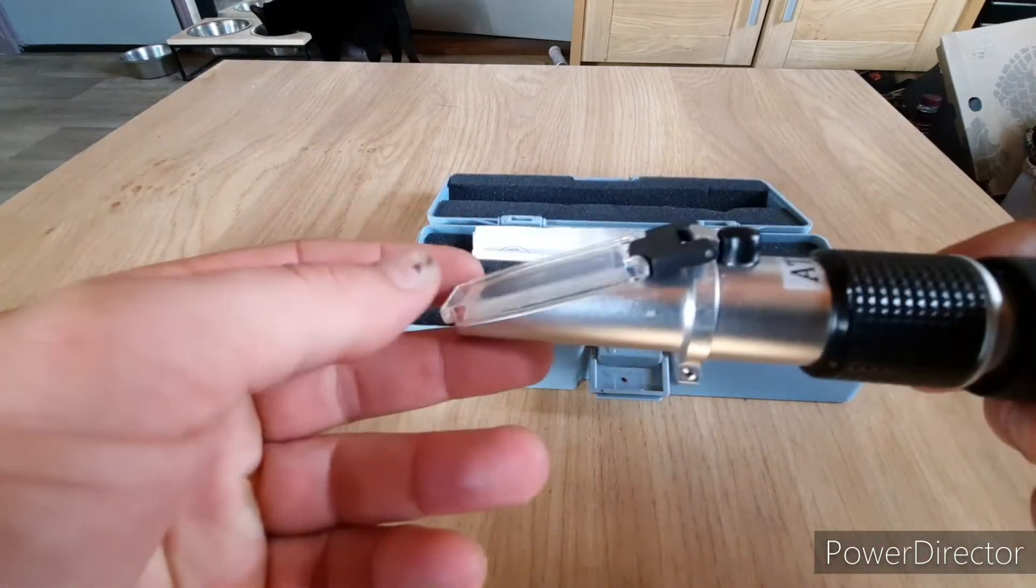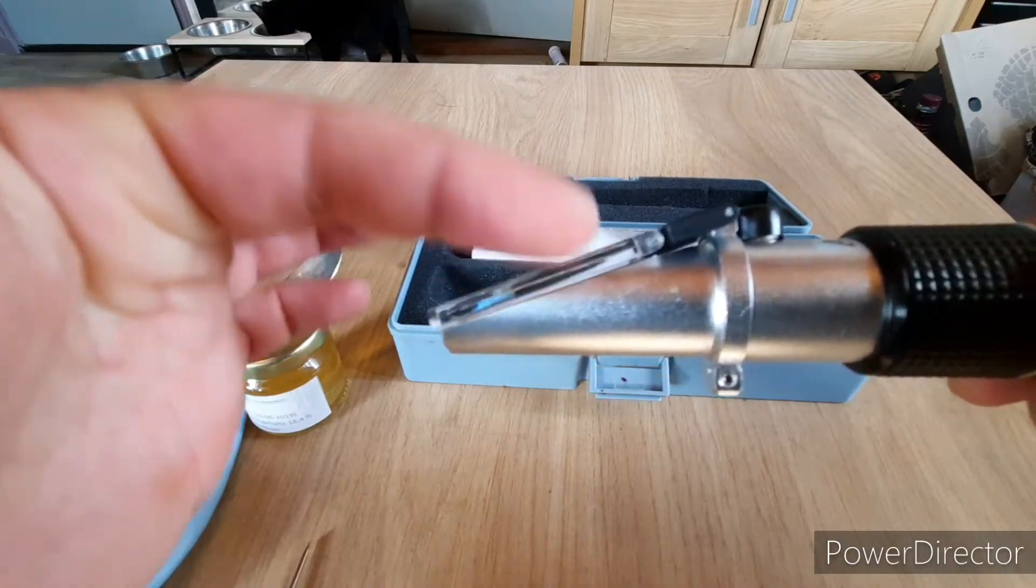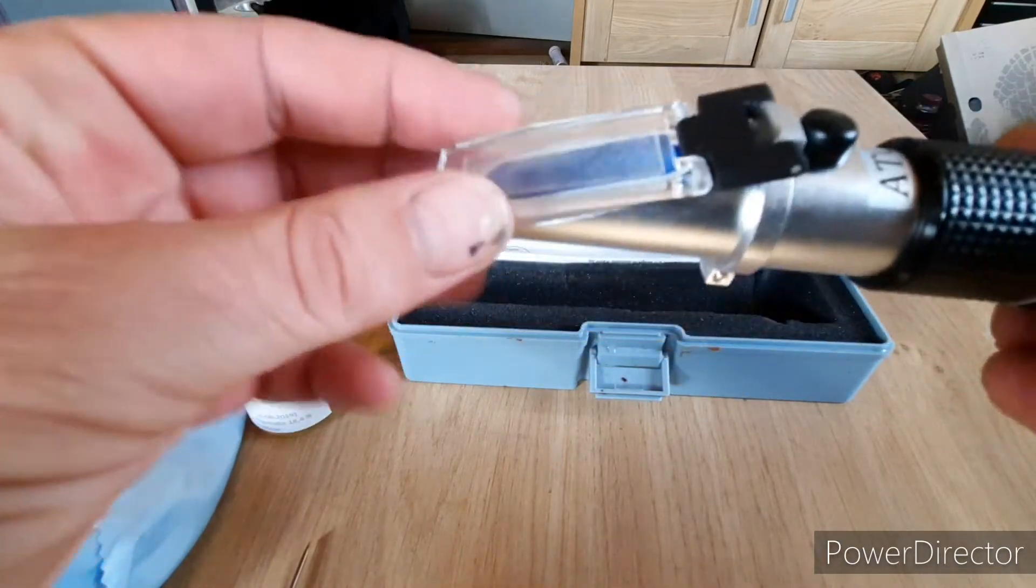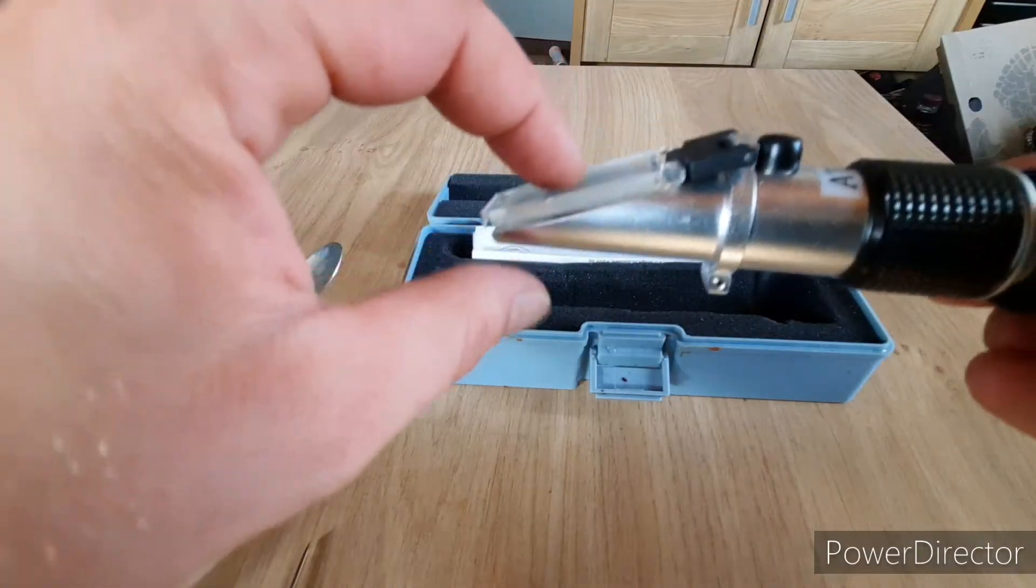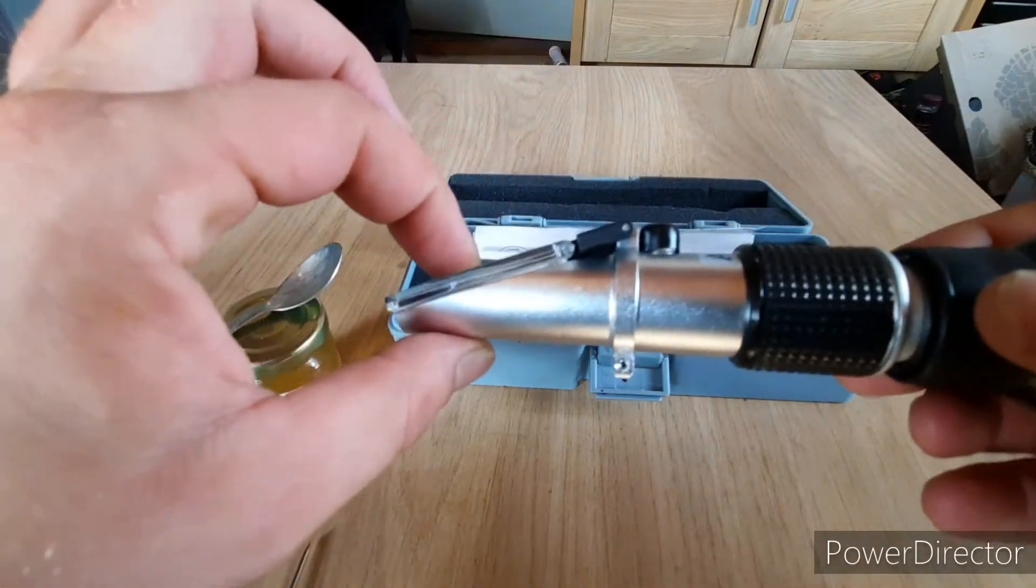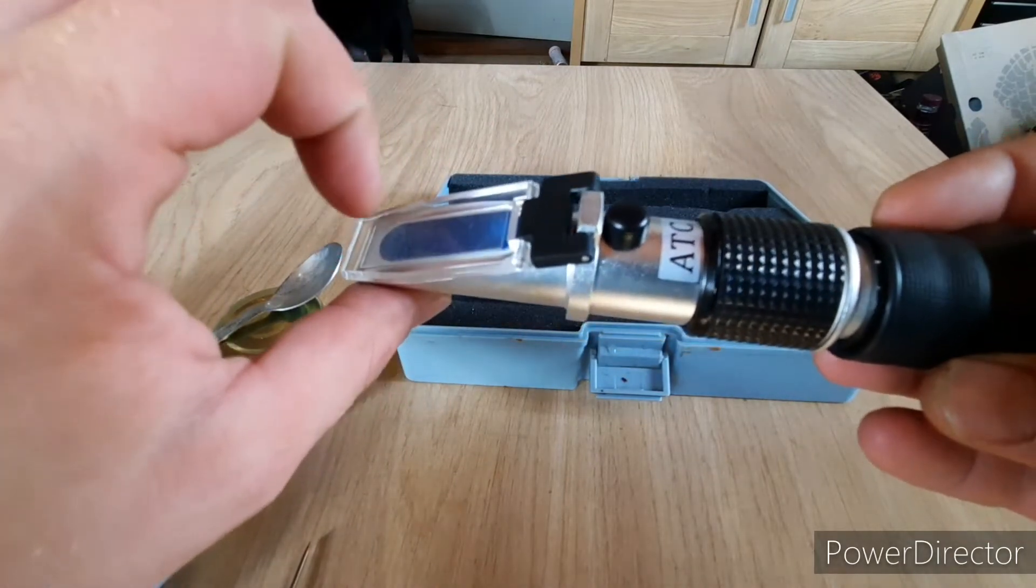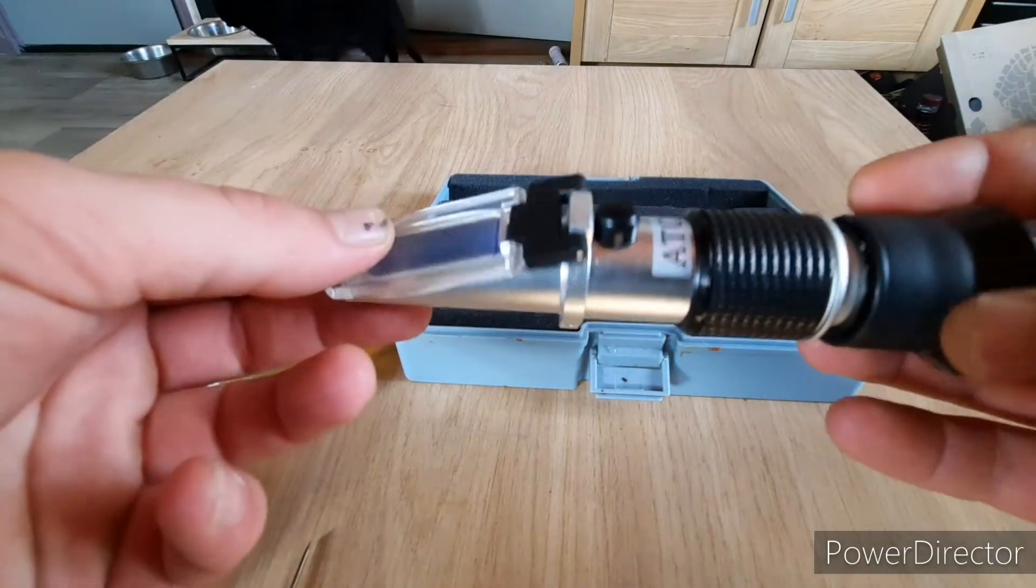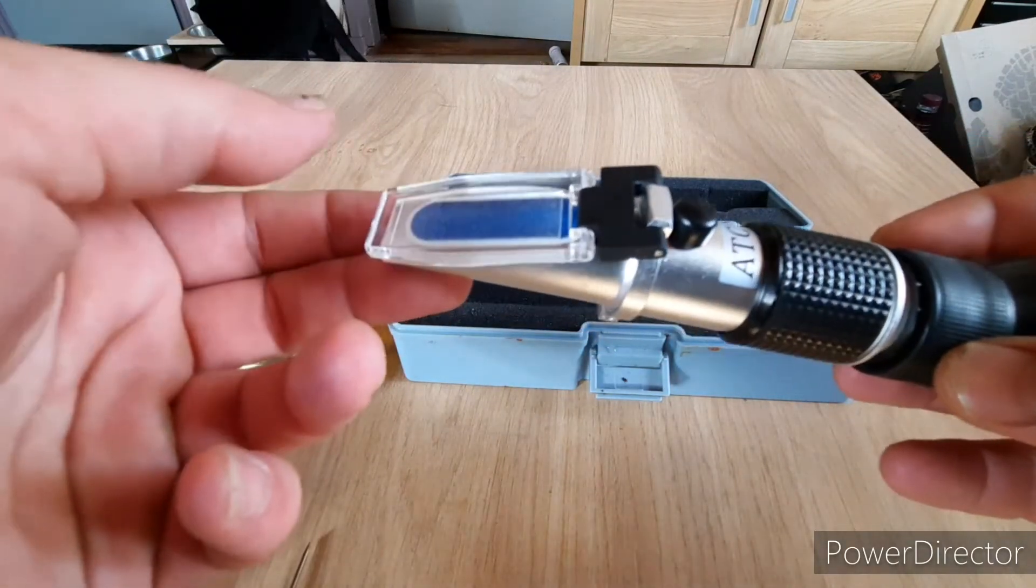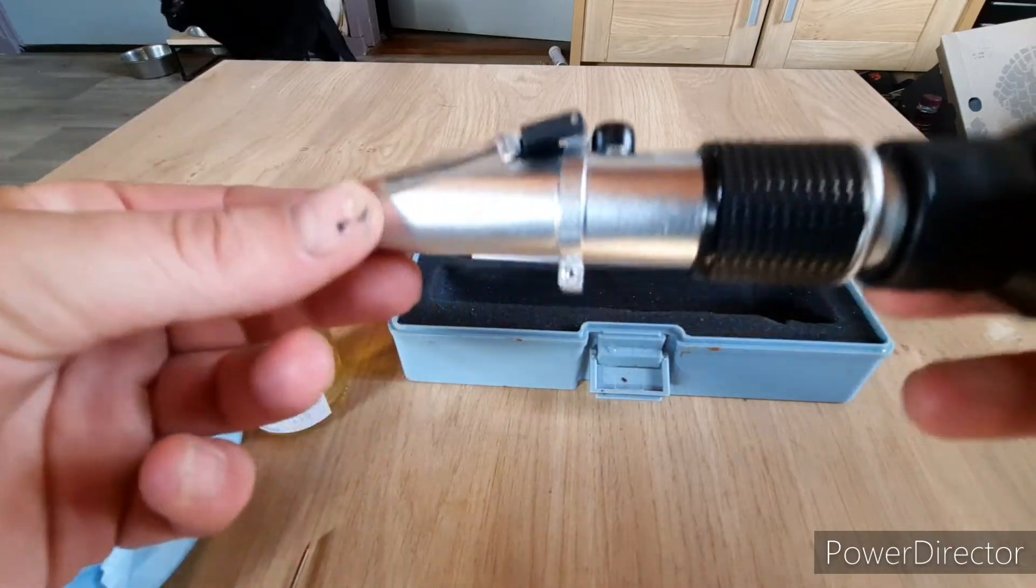You put the fluid here, close it up, look into the lights and then the refractometer will tell you in this case how much sugar there is in the content. You've also got refractometers for alcohol, for sugar, for many different things, but this is one that's specifically for use with honey.